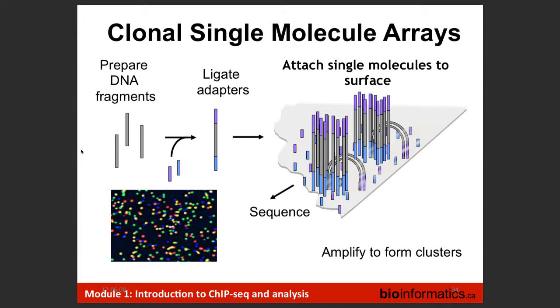For heterochromatin, you need enzymatic digestion and really good sequencing. Is it possible, if I have half of the samples prepared by DNA shearing and sequenced, and use the enzymatic approach for the heterochromatin, for example for H3K9 or H3K27 trimethylation, to actually bring them together?